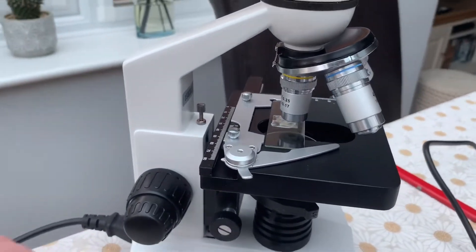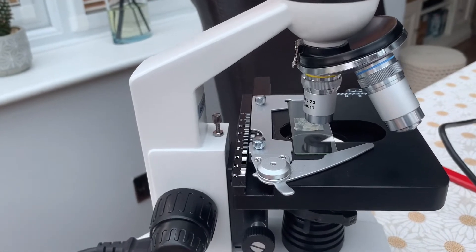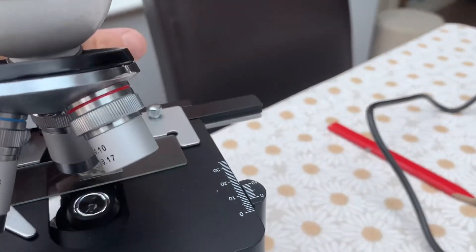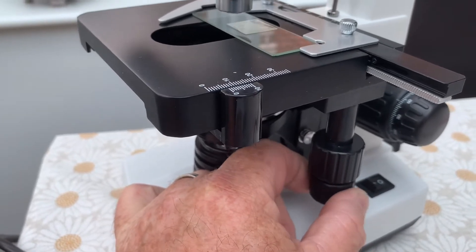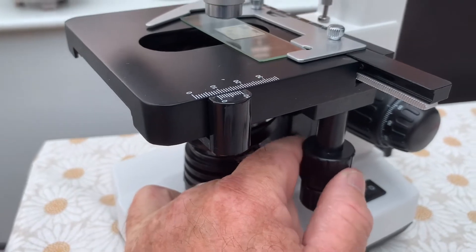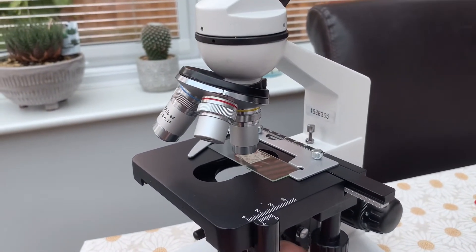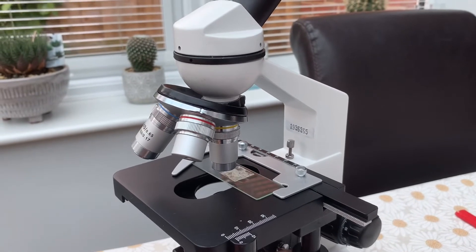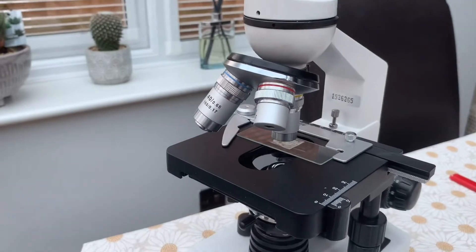The mechanical stage actually moves the slide for you. It's controlled by these two dials here — that one moves left to right, and the top one moves it backwards and forwards, the XY axis. This makes life a lot easier because you can start from one edge of the slide at the top corner, go along, and when you reach the end move to the next row and go back the other way, covering every part of your sample.